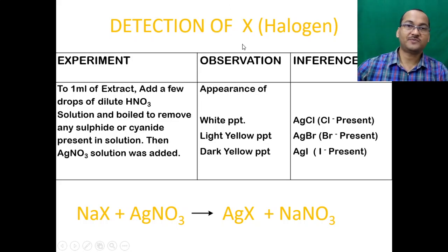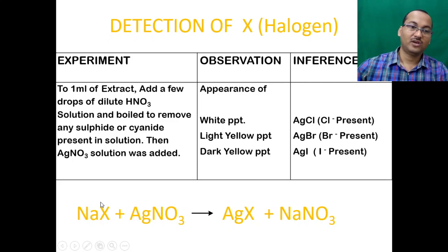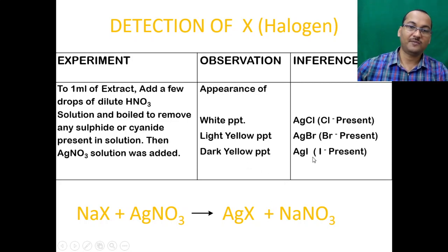For detection of halogens, take 2 ml of extract, add a few drops of dilute nitric acid solution, and boil it to remove any excess sulfide or cyanide. Then add silver nitrate solution. The sodium halide in the Lassaigne extract reacts with silver nitrate giving silver halide. AgCl gives a white precipitate, AgBr gives a light yellow precipitate, and AgI gives a dark yellow precipitate.